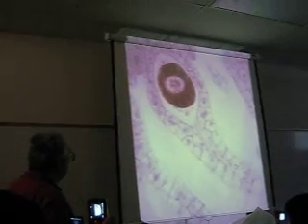Number three is the female. There's a lot of them that aren't so good, just in bits and pieces. There's the archegonia. Hunt around if you find some good archegonia. Like here, there's only one good one on this whole slide, and then that's broken. See, there's the venter with the egg and there's the neck, which is broken. But hunt around — this is a nice one here. You can see the egg, egg nucleus inside the venter.